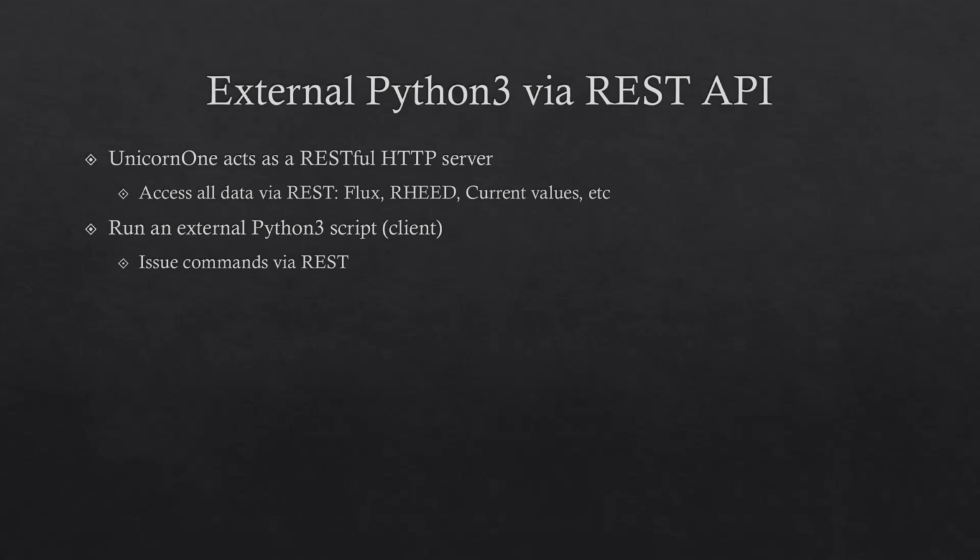The application does not need to know serial protocols, which vendor manufactured the instrument, or how the underlying data is stored. Those problems have already been solved by UnicornOne. The developer can concentrate on the new application, algorithm, or AI model rather than rebuilding device integration and infrastructure.